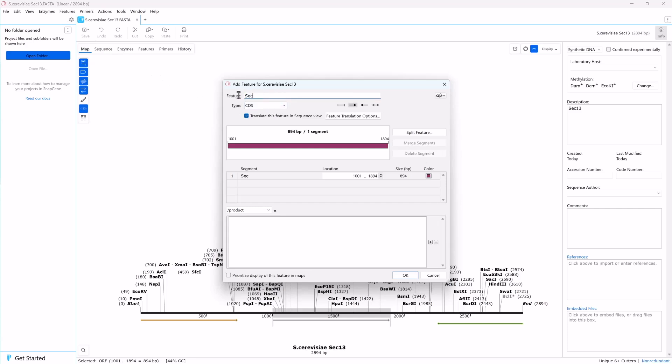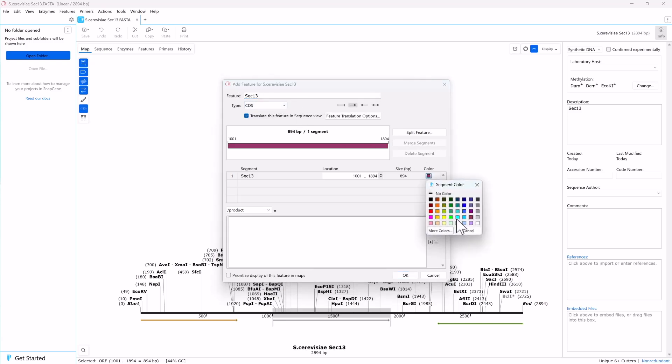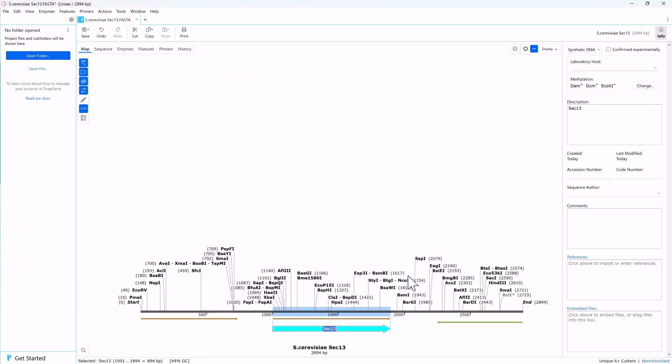SnapGene has already defined this feature as a coding sequence, or CDS, which means it will be translated. You can also give this feature a custom color. Click OK to return to the map.